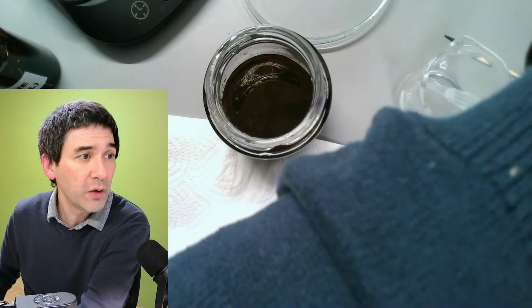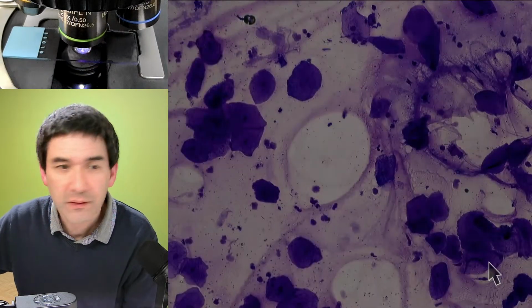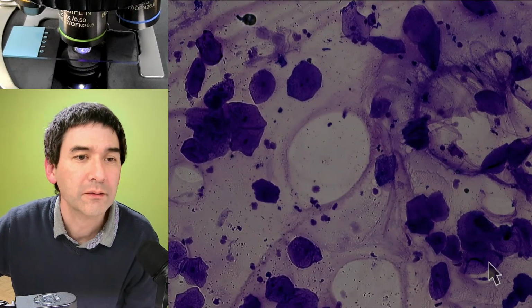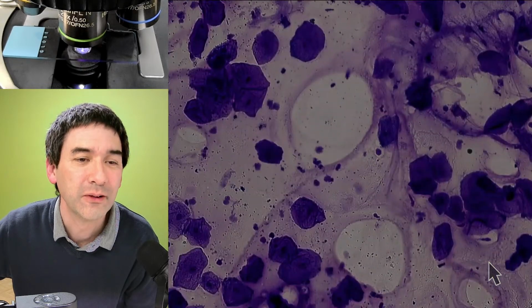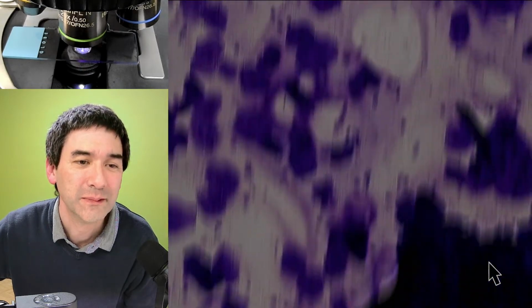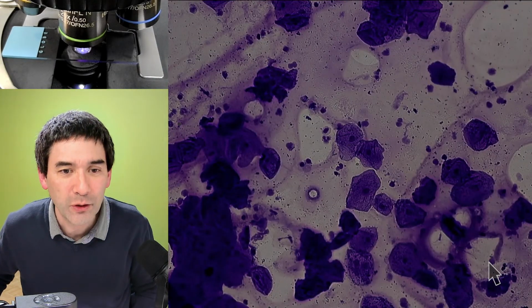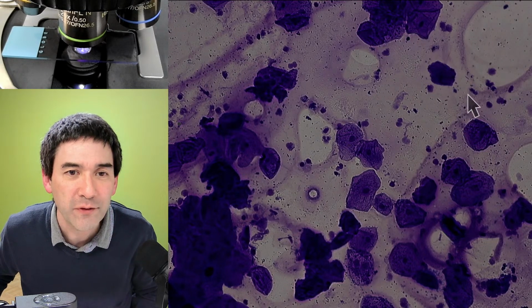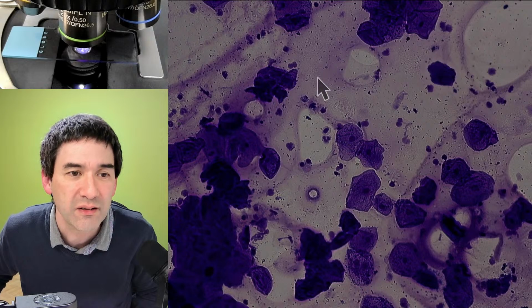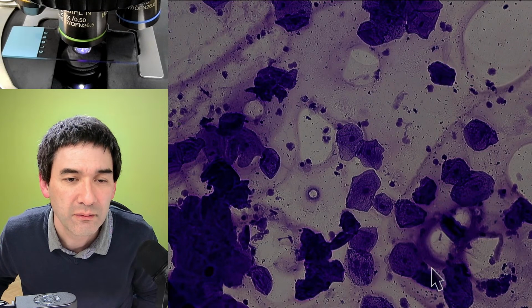I'm switching now the scope view, and look at this. Okay. So very nice. So what we see here, of course, is the following. You see the cells here in the center, the dark nucleus, and the stuff here seems to be mucus that's stained in the back here, right? But you see, you've got the individual cells here.